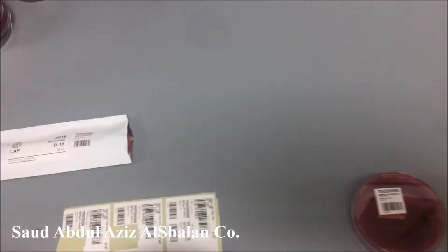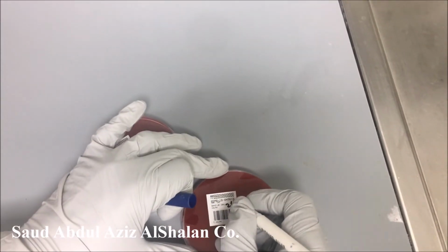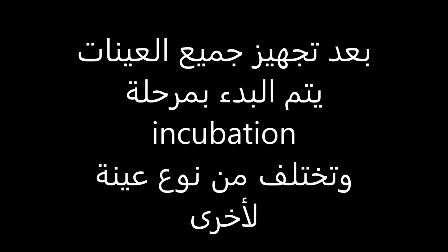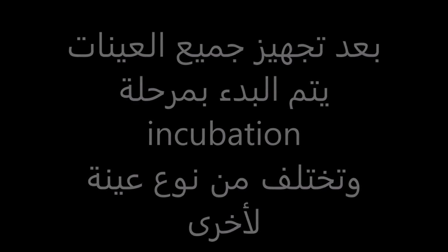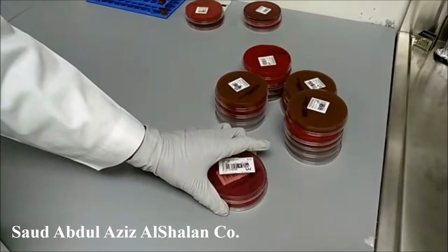So we will label it with the date. Now we set all our plates and streak them.